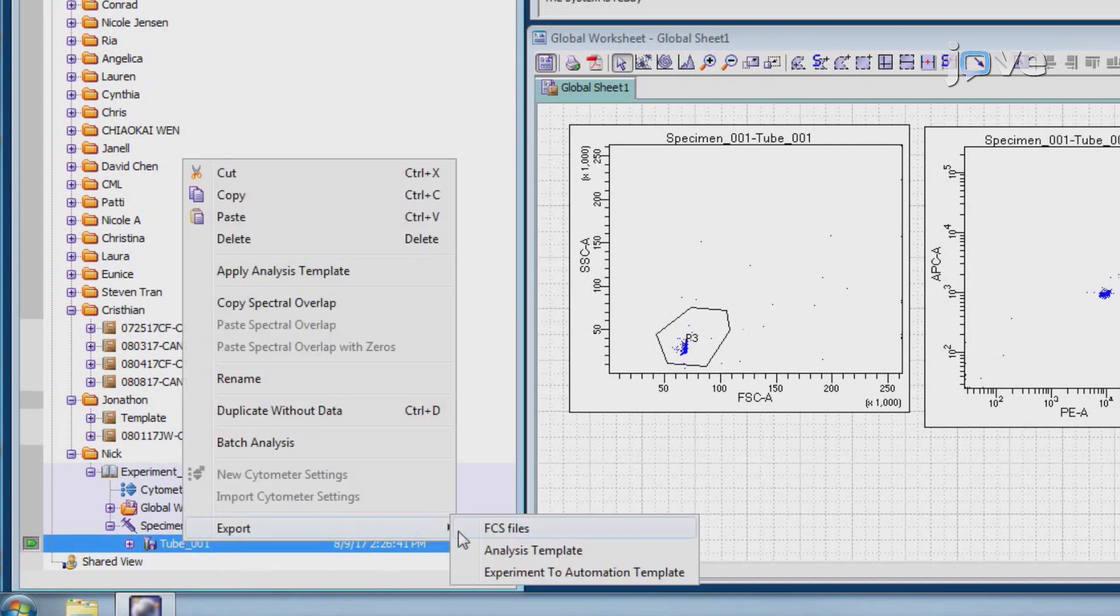Export only the gated events, rather than total events, before performing data analysis as described in the text protocol.